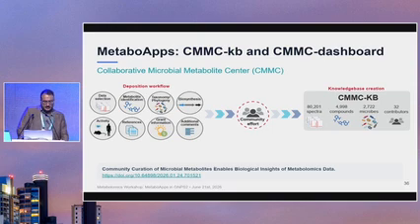And the idea, as I mentioned before, for the drug and foods, we've done a curation of a spectral database for our own samples, for public repositories. It depends a little bit on each of those tools. And for the CMMC knowledge base, the labs that are part of it, but any of you that work with microbial data sets can also upload your data for the CMMC.